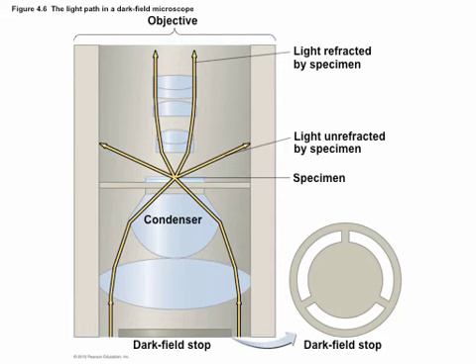But when the light's moving along, if it runs into something, it scatters. It bounces in a random direction. So anything that's there is going to look bright. You see the dark background, and let's say you've got one little thing right here. The light comes in, it goes boink, and some of it hits your eyes. So you're only going to be able to see the things that are there because that's the only bit that's going to be directing light towards your eyes. Dark field is going to have very good contrast. It's going to have somewhat less good resolution, but you'll be able to see things that you wouldn't be able to see with bright field.